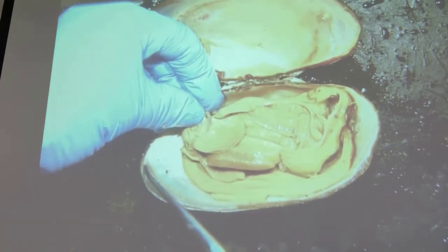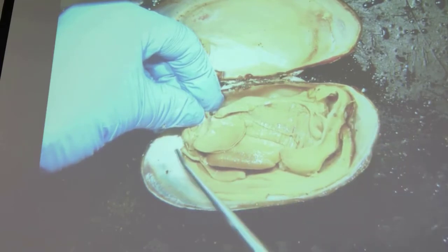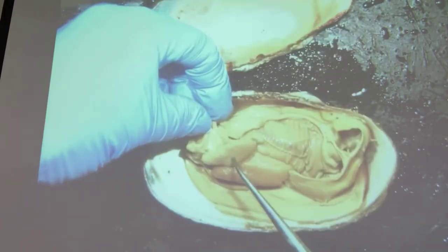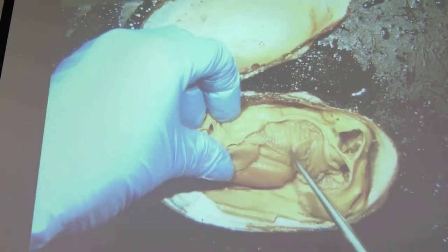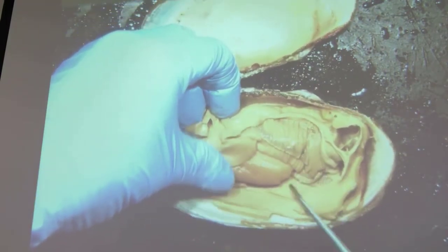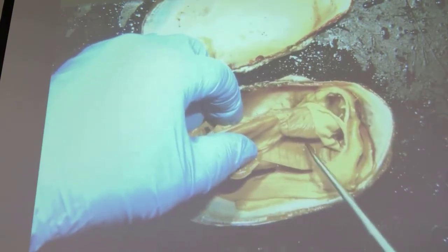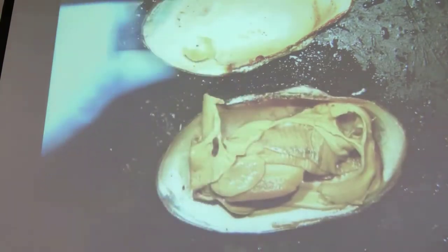So this is the anterior end, and the posterior end is where the siphons are located. At the anterior end, we would have the mouth surrounded by the labial palps. As we go back towards the posterior end, these striated structures here are the gills, which are used for gas exchange and also helping to filter out food from water coming in through the incurrent siphon.